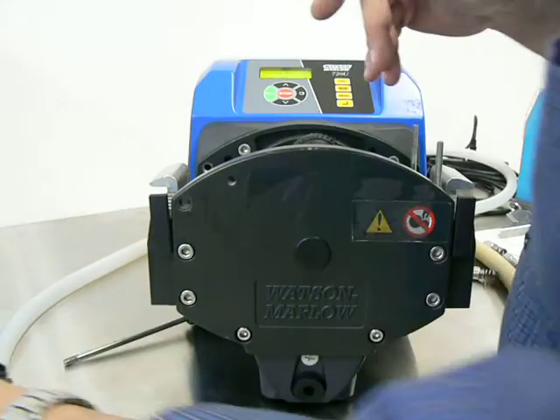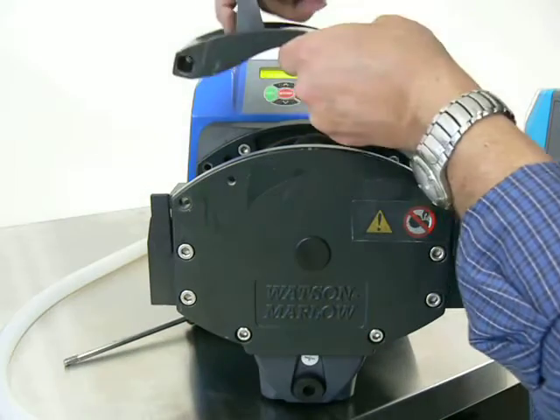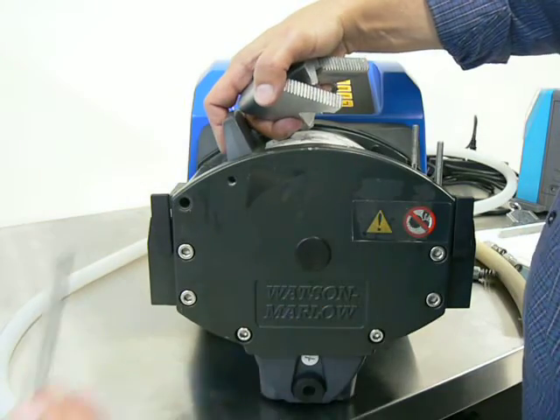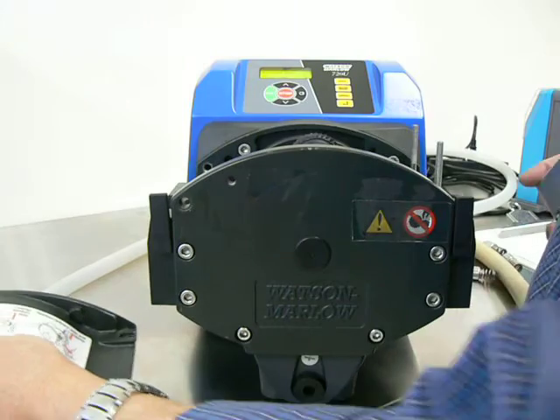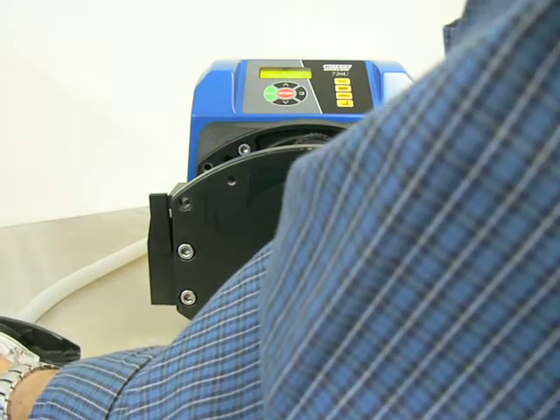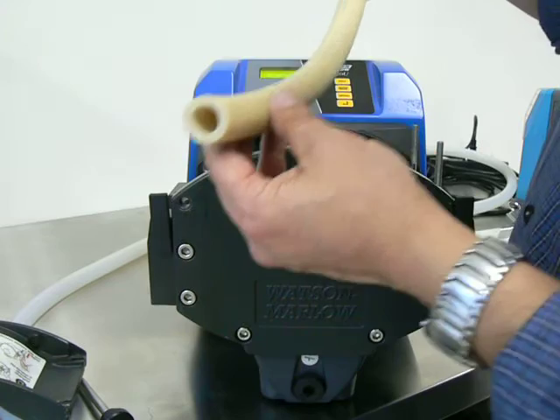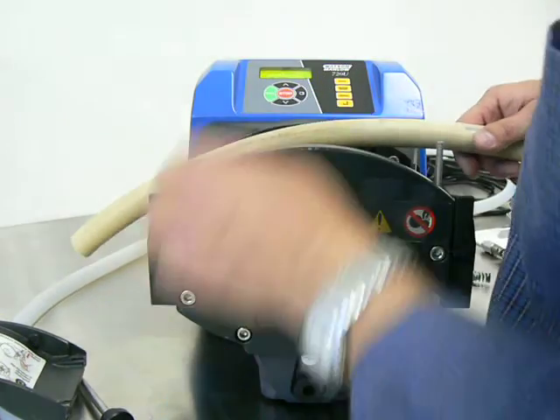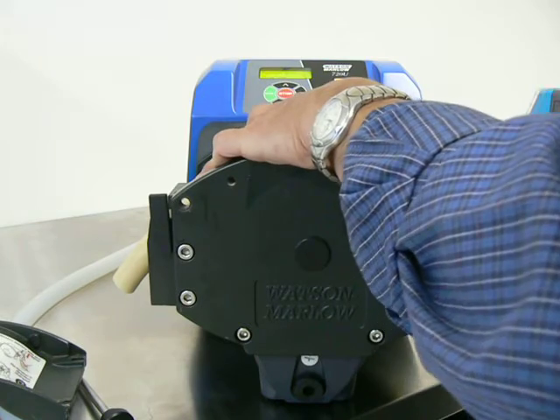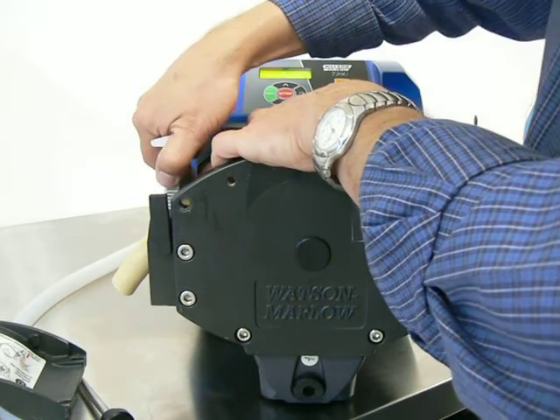Assuming you have the right tubing chosen, let me show you how to install it. Once you have the lid, you pull this rod out and pull these clamps out — they come out very easily when there's no tubing. We're going to install a piece of tubing with 4.8mm wall thickness, as this particular pump is set for. You lay the tubing across the head and loosely put these tightening clamps in.